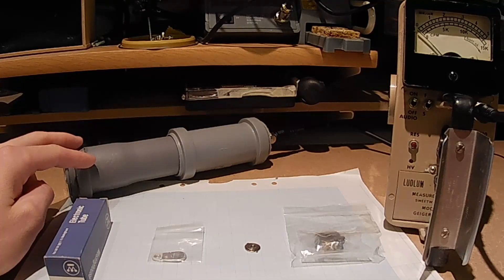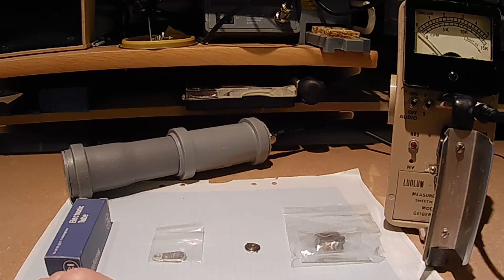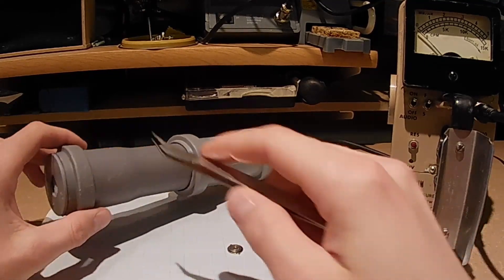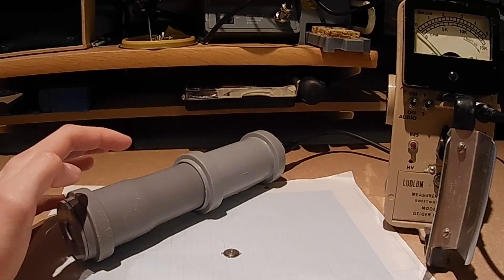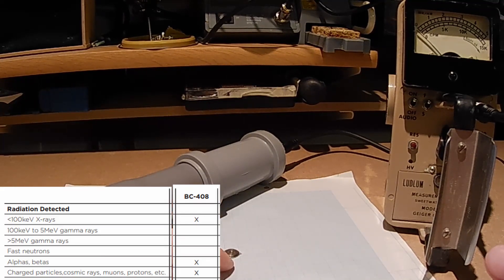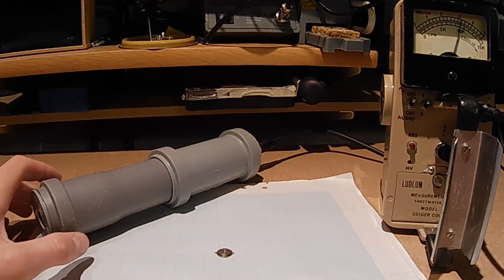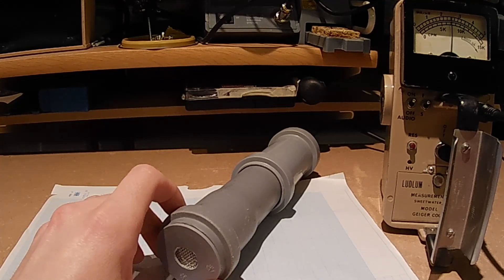I've now hooked up the alpha-beta-gamma scintillation detector to the Ludlum Model 2 rate meter, running at 900 volts. The gamma radiation from this americium-241 should be able to penetrate through the probe housing. However, the BC-408 scintillation plastic in this detector should not be able to pick up any gamma radiation under 100 kilo-electron volts, which means it should not be able to pick up the gamma radiation from this source. Let's turn it on and put it over the source. Nothing really happens.